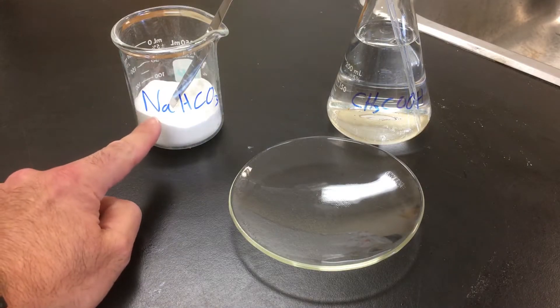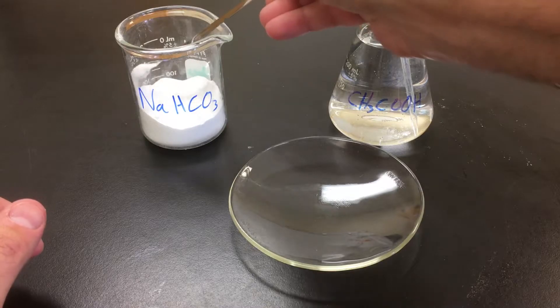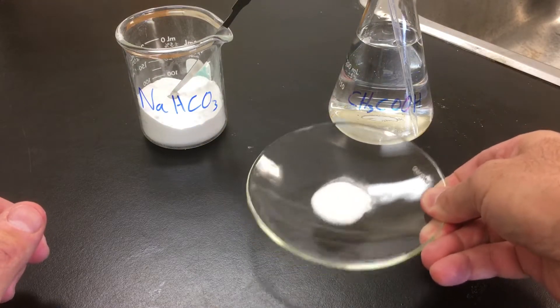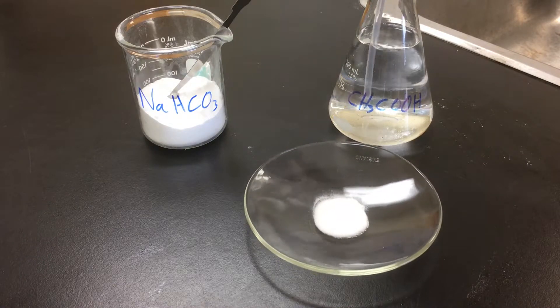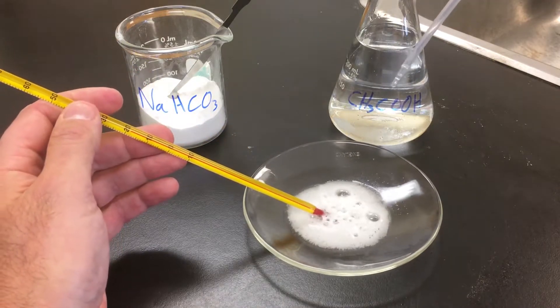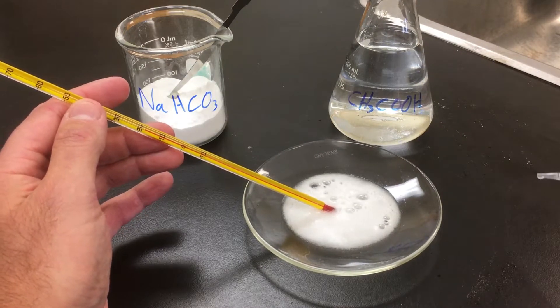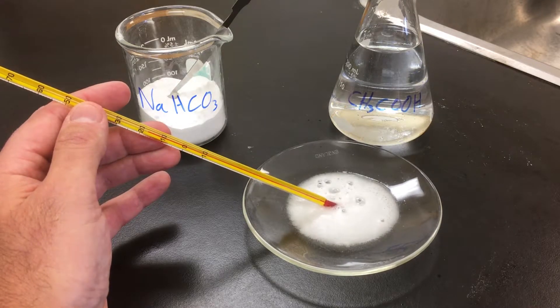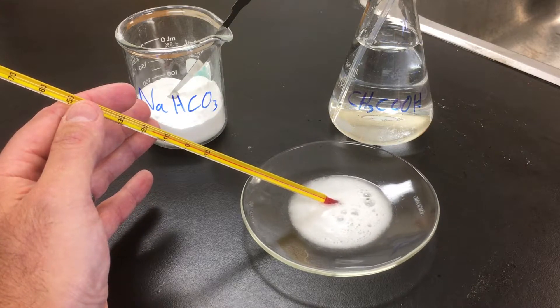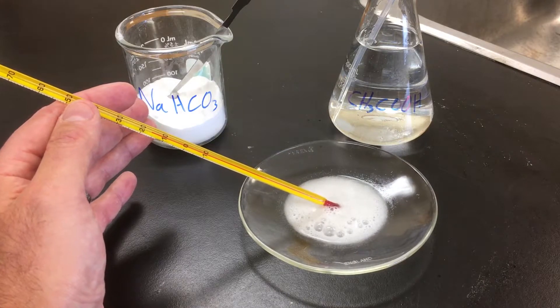Pair number two: we have sodium hydrogen carbonate and acetic acid. We start with the solid sodium hydrogen carbonate in the dish. The acetic acid is a very clear solution. Immediately upon adding the acid, there is vigorous bubbling and fizzing. There is no significant change in temperature — maybe a slight decrease of one to one and a half degrees Celsius.